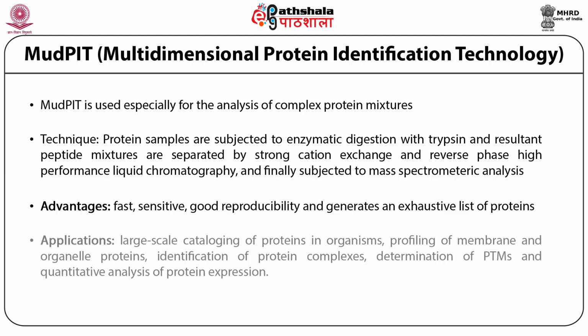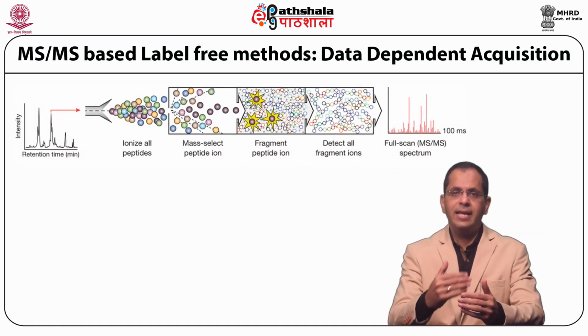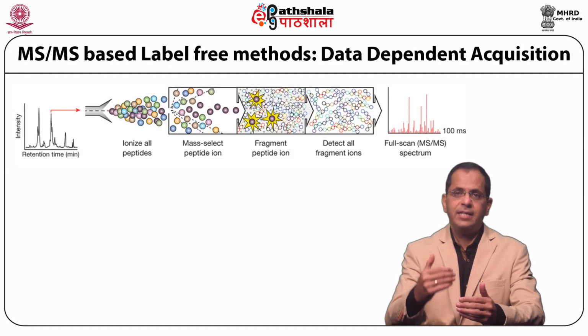These could be applied for large-scale cataloging of proteins in organisms, profiling of membrane and organelle proteins, identification of protein complexes, determination of post-translational modifications, and quantitative analysis of protein expression. MS/MS based label free, gel free methods.